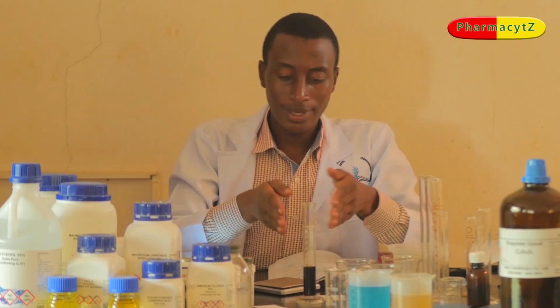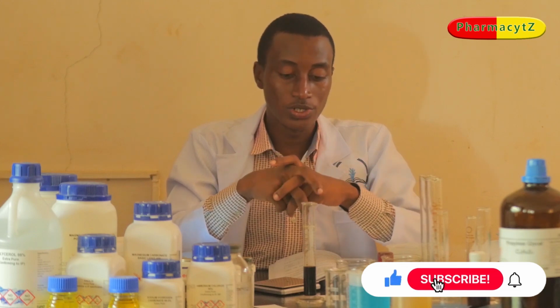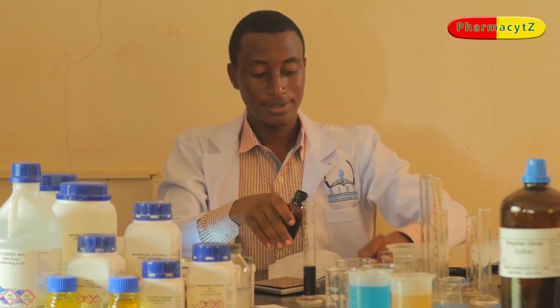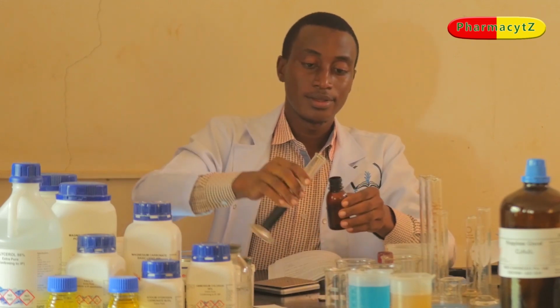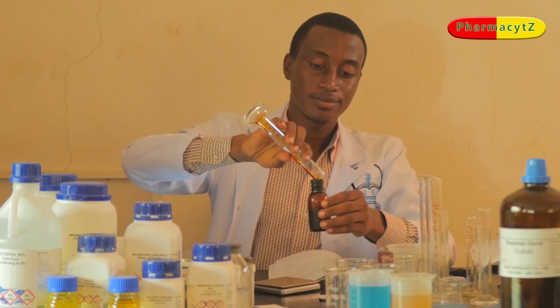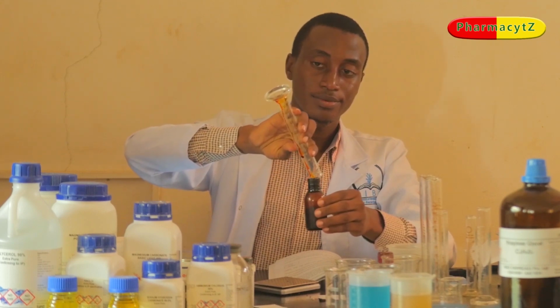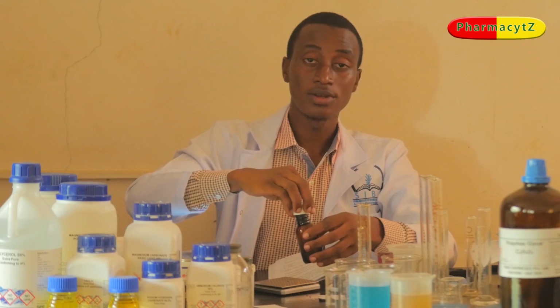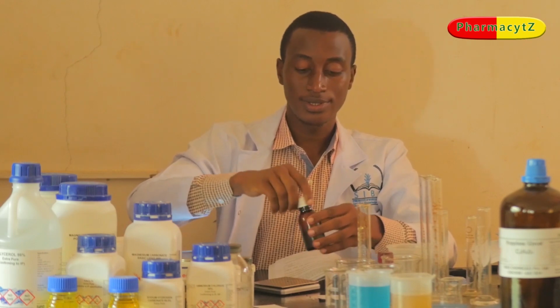Now, this is what we call aqueous iodine solution or Lugol's solution. After you are done, you pack your product in an amber colored container so as to avoid reaction with light. After packing your product, you label it according to labeling procedures.